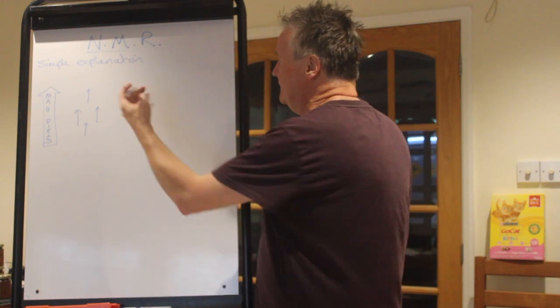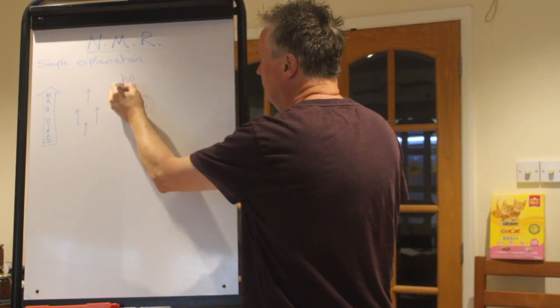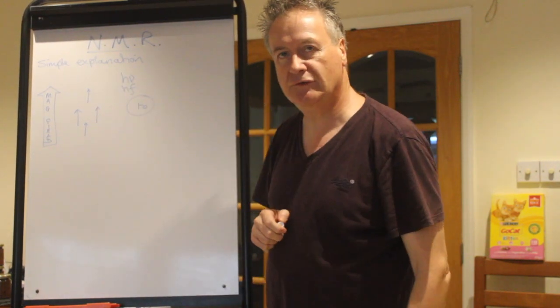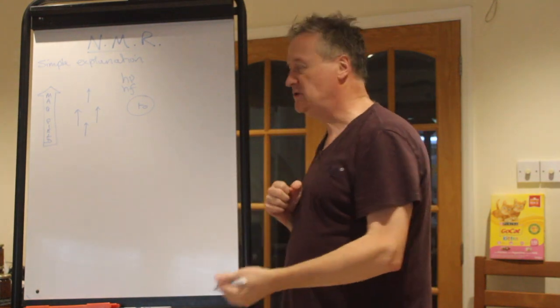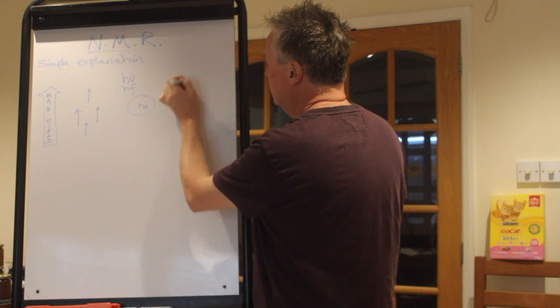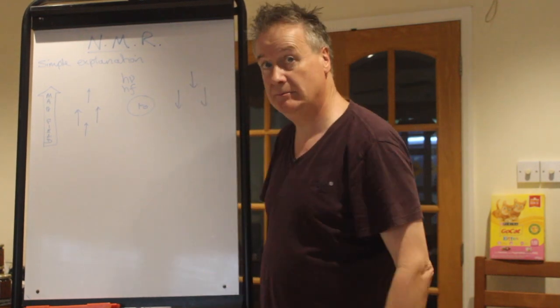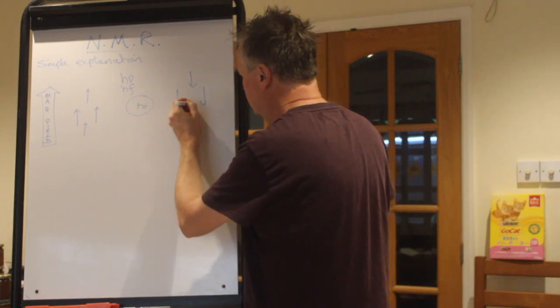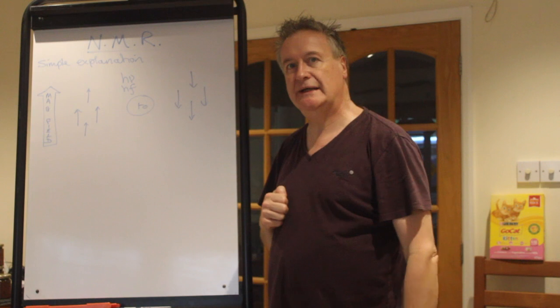And if you put in the energy, depends which symbol you use for frequency, if you get the right energy, it will go and do this to the magnet. Now I've only drawn 4, you can imagine there are billions upon billions in an actual sample. So you will make it do the opposite alignment.